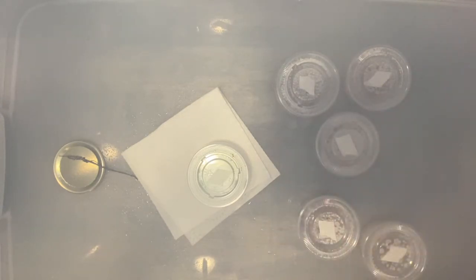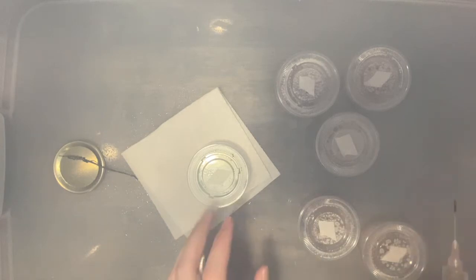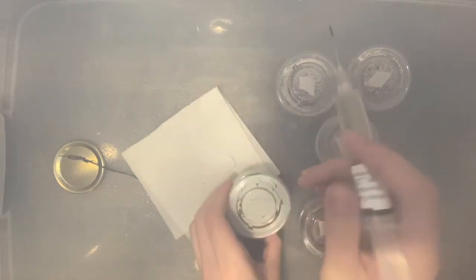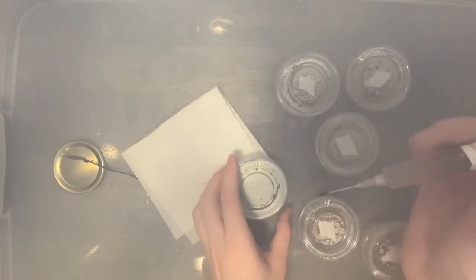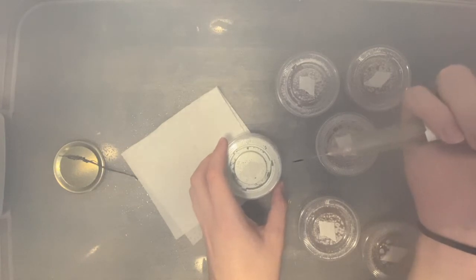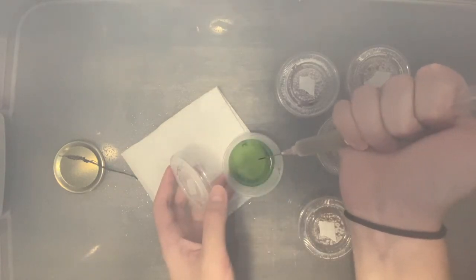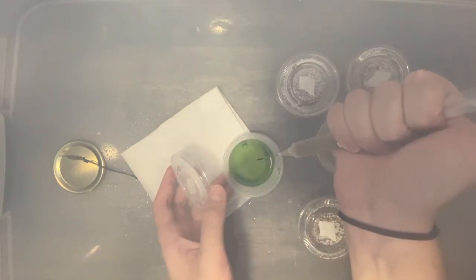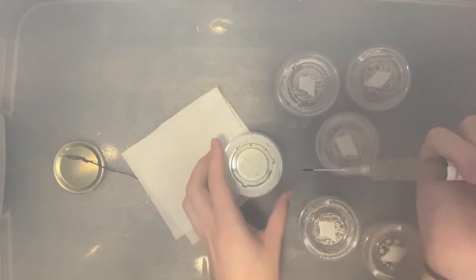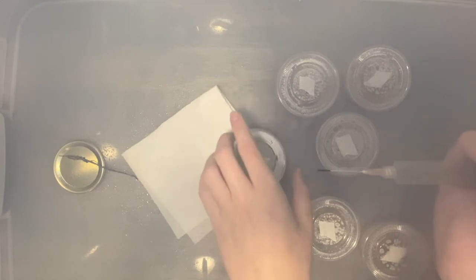I'm now flame sterilizing the tip of the white oyster needle. Okay, so now I'm gonna give it a second to cool off. And then whenever it does, I'm injecting less than 1 cc onto the actual agar dish. Oh, that was way too much, but you see, I injected just a little bit onto the top of the plate. Now we're gonna set that aside for a couple.